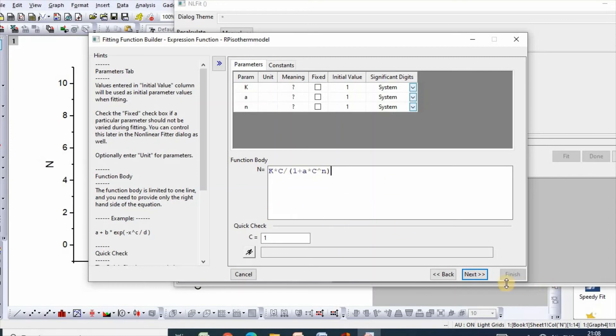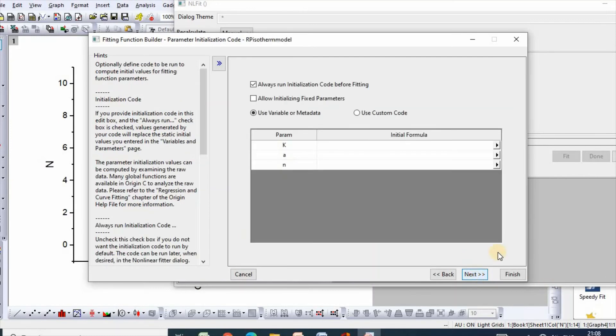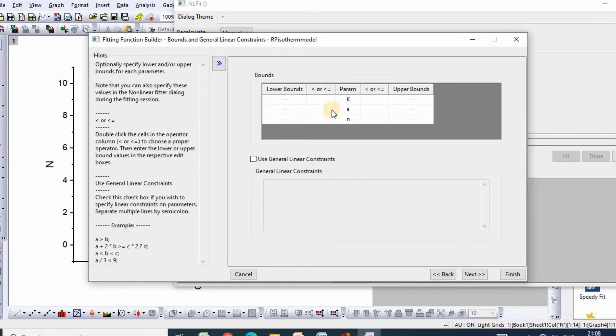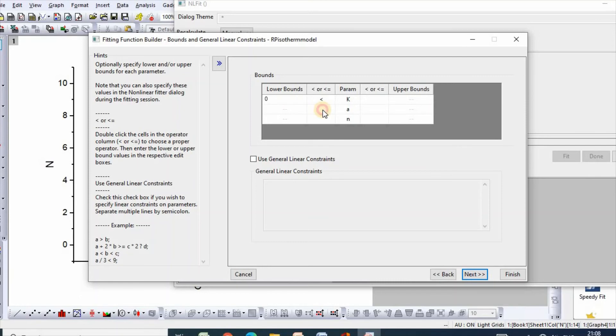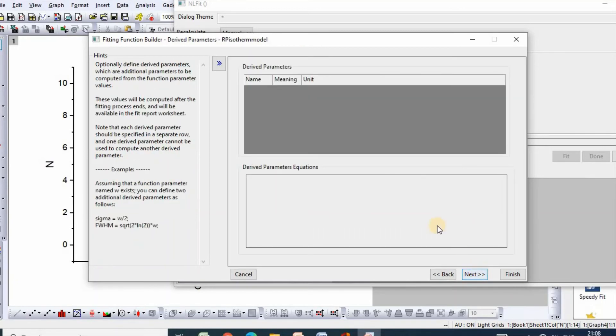Click next, click next, then also click next. Then you need to select bounds. Set K, a, and n each to lower bound of 0. Then click next.